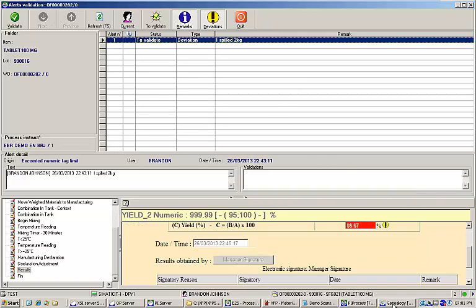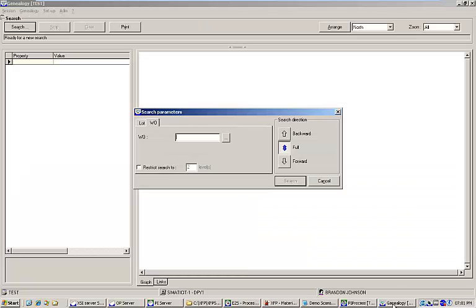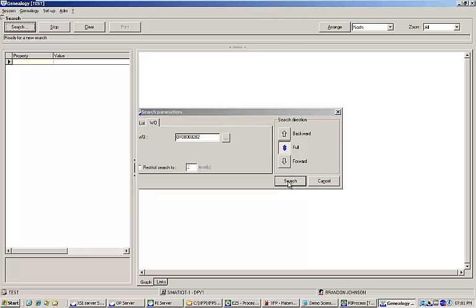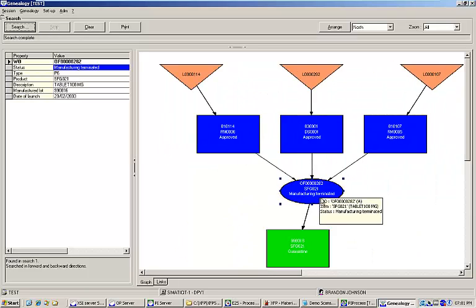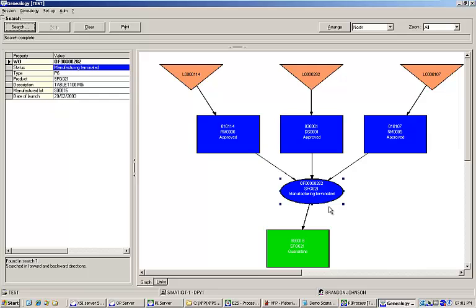Furthermore, powerful tools allow you to easily trace product genealogy via visual flowcharts and graphs. For instance, I'll input the work order number that I just executed into the genealogy search box.